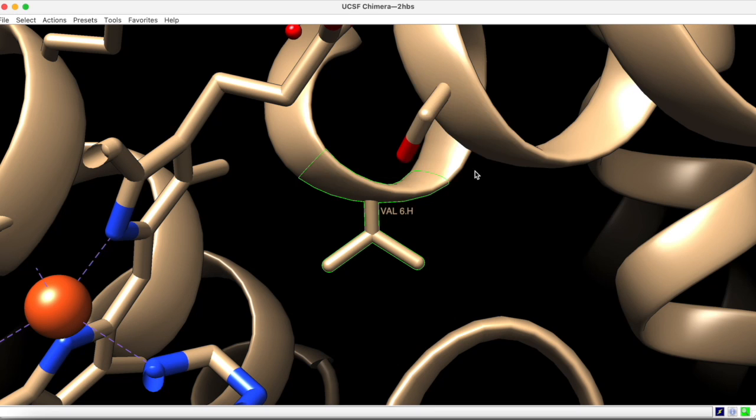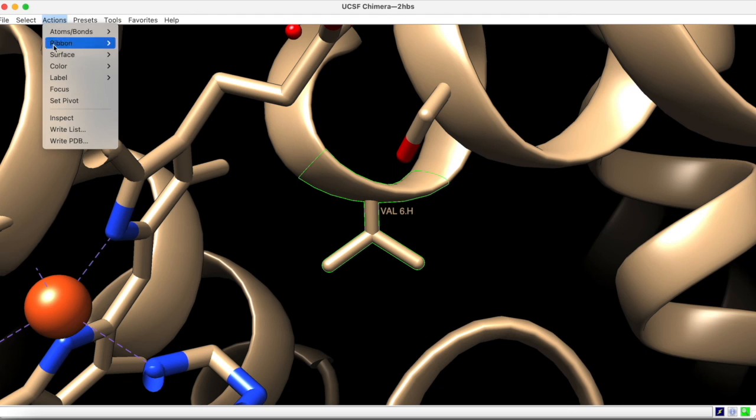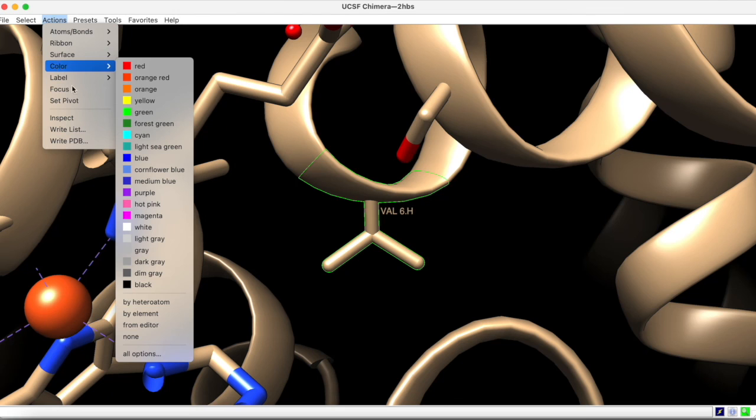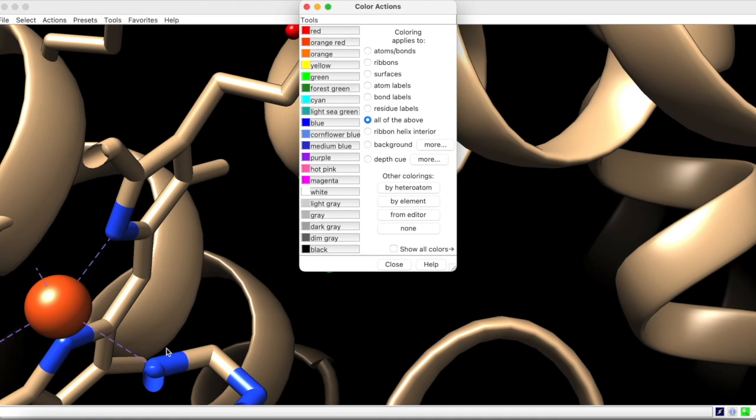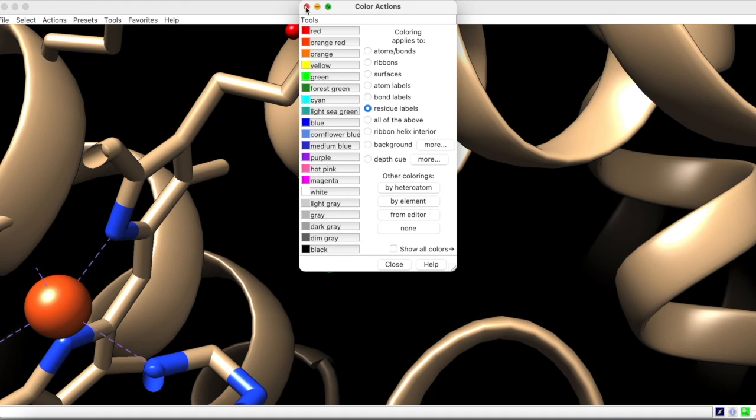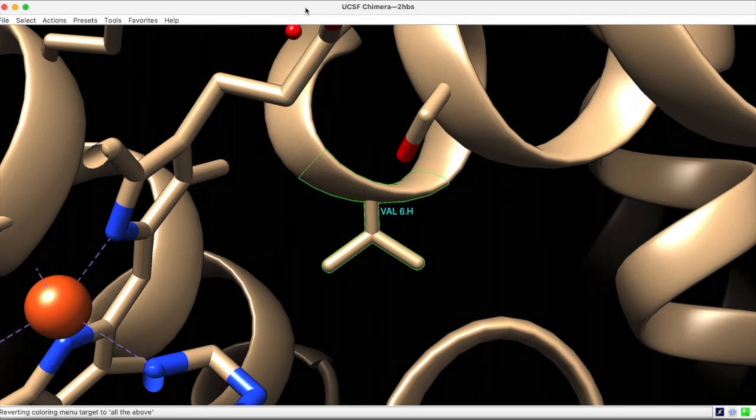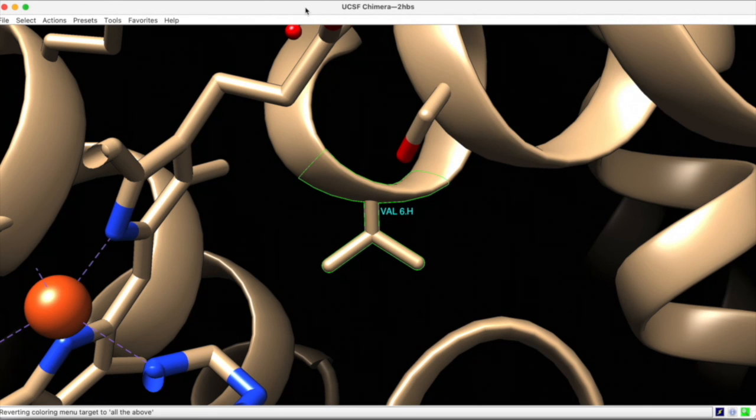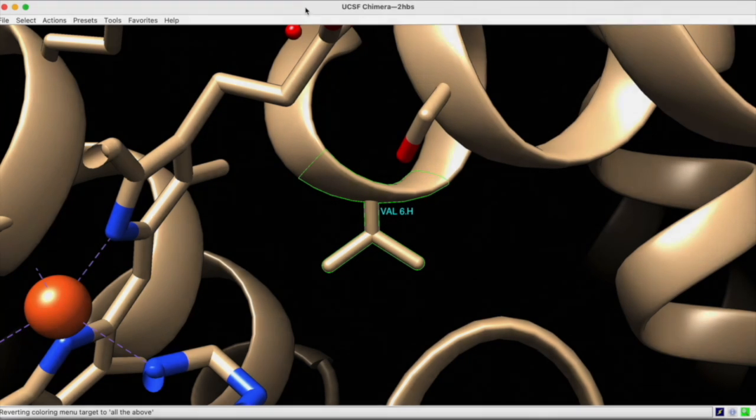If you would like the label to contrast with the surrounding protein, you can go to actions, color, and under all options, selectively apply the coloring to residue labels. Then, you can choose a color that provides better contrast.